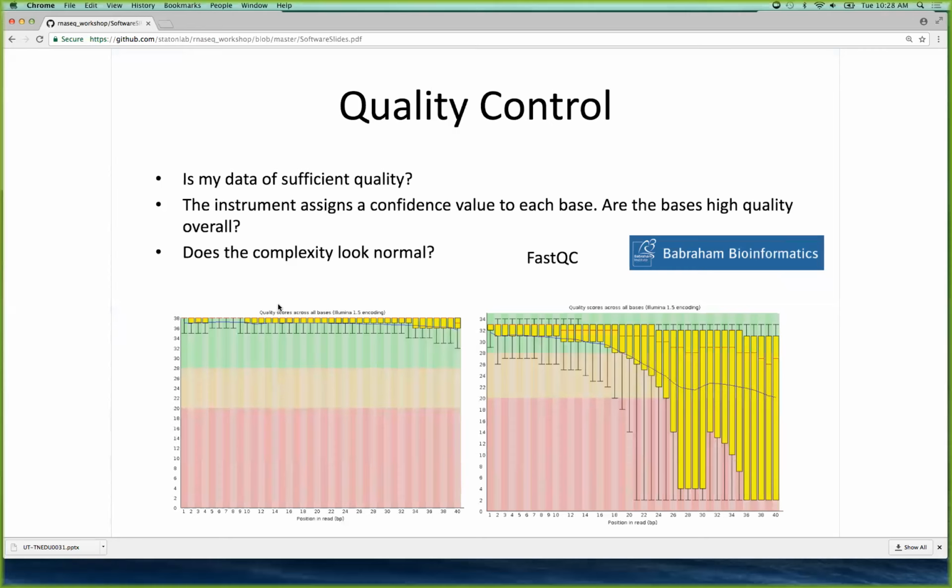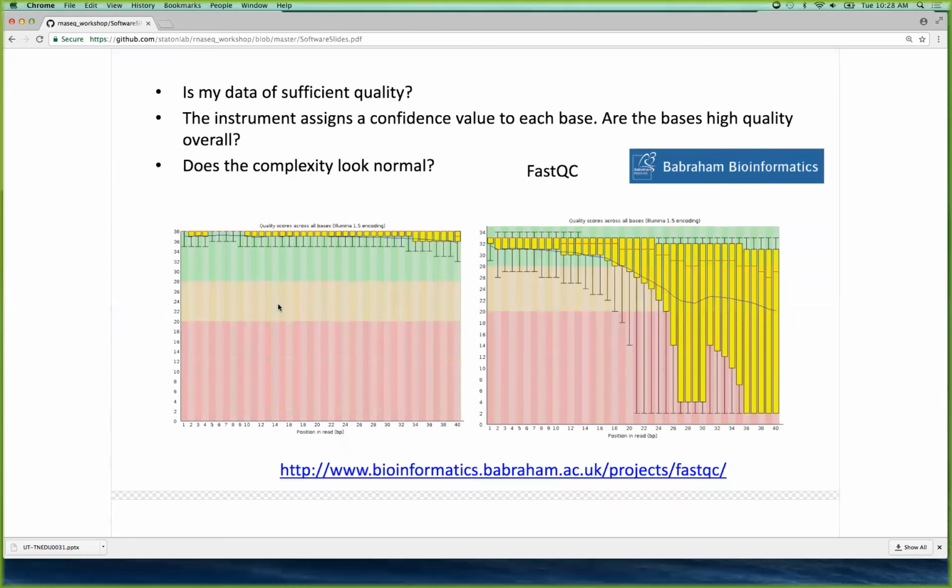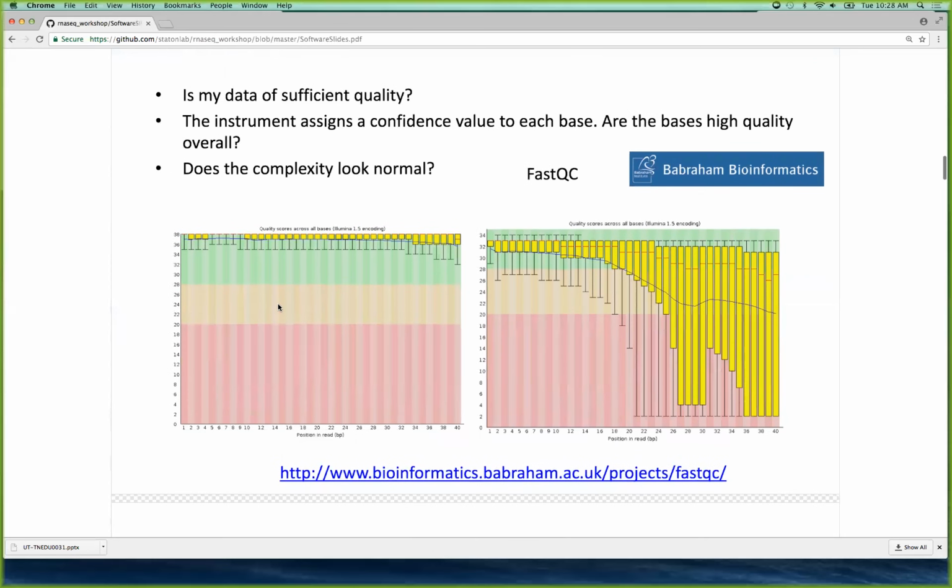So is this a graphical presentation of that fourth line, the Q plot? Yes. This is the average of that fourth line. And that's 41 nucleotides, right? Just to make sure there's 41. Well, in this case, 40, yeah, there are 40 nucleotides. Usually when the reads come out of the sequencer, they all have the same length.